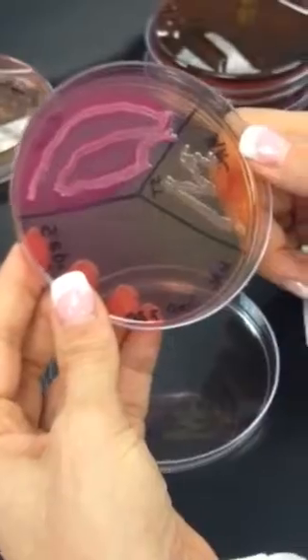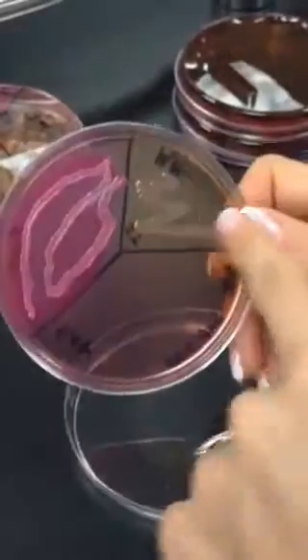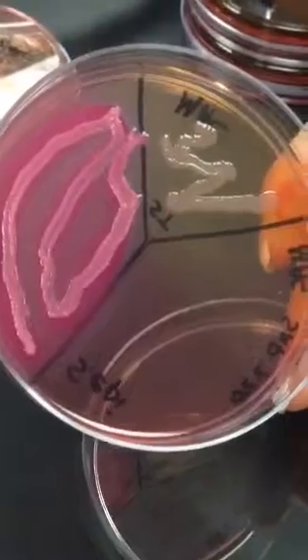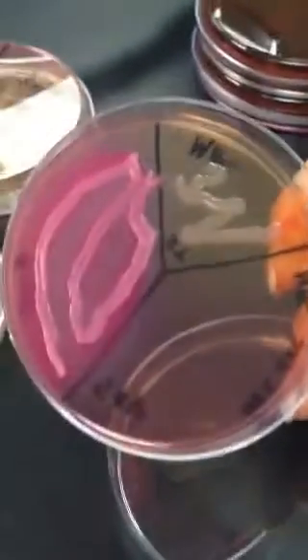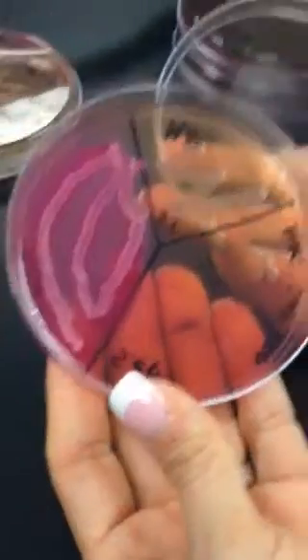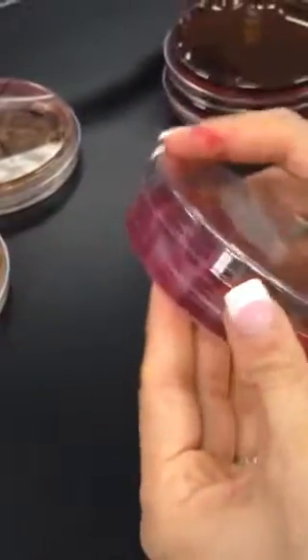It's pretty. Salmonella is Enterobacteriaceae, so it will grow on MacConkey agar, but it's an unfriendly, non-lactose fermenter. Salmonella, no, we don't have it. E. coli, yeah, we have E. coli. Salmonella, we don't have. It's pathogenic to us. Chickens have salmonella. So it's a non-lactose fermenter, unfriendly. You'll get growth of it, but it won't have a color change. It'll just be sort of a dull color.